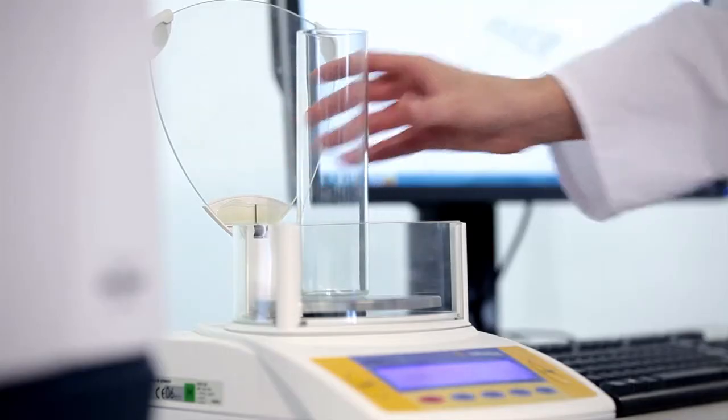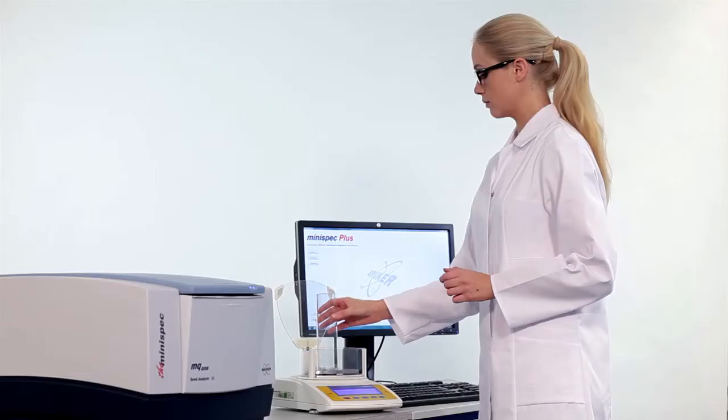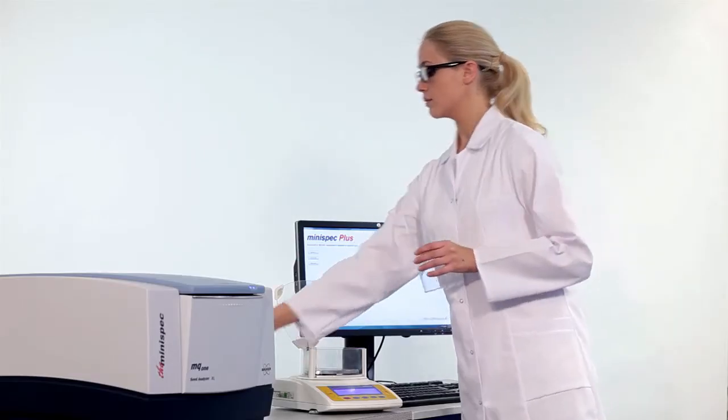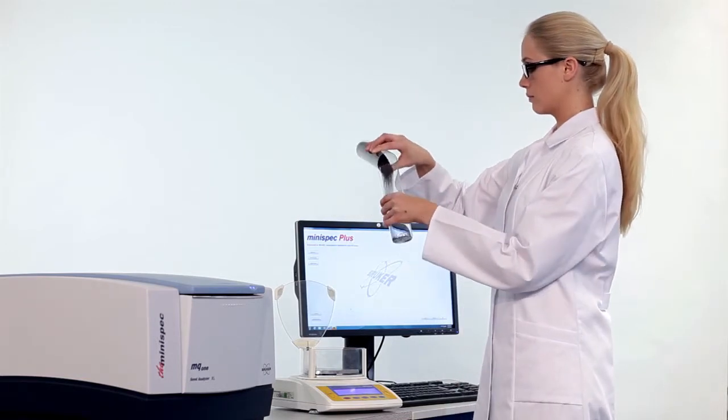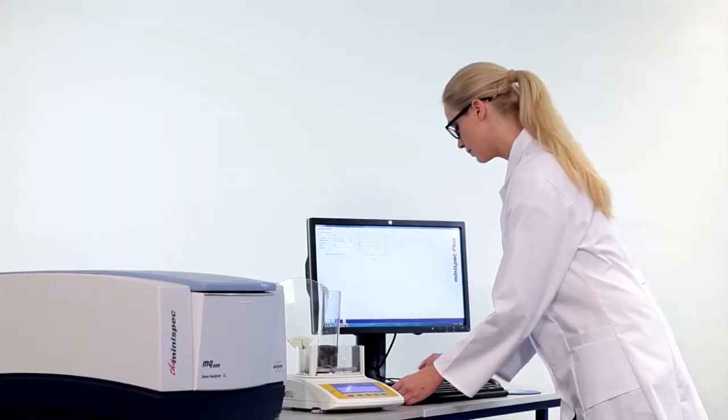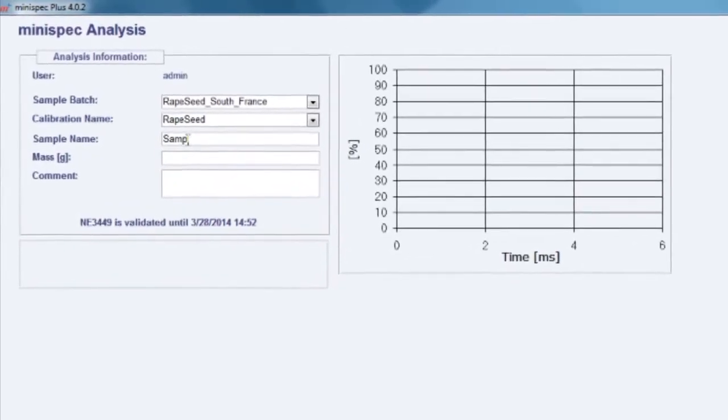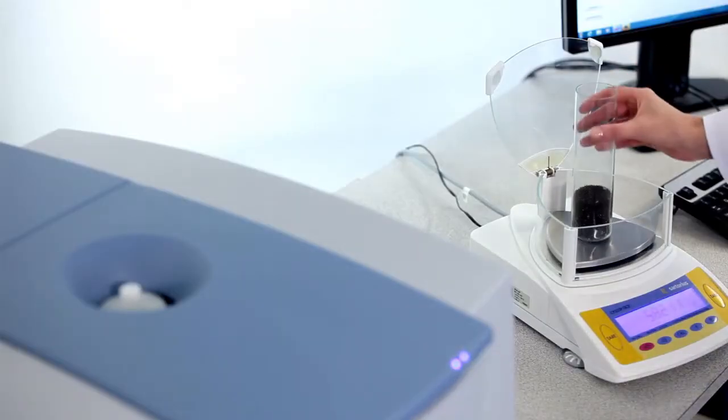No grinding, no solvent extraction, or sample preparation is required. The workflow for oil and moisture determination is simple: weigh the sample, transfer the weight to the PC, insert the sample tube into the minispec, and the measurement starts automatically by sample detection.